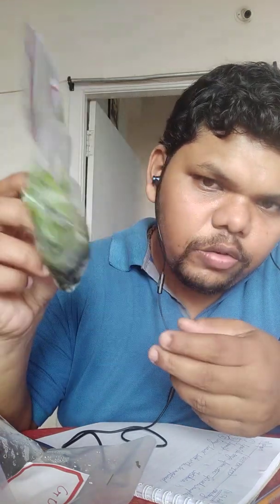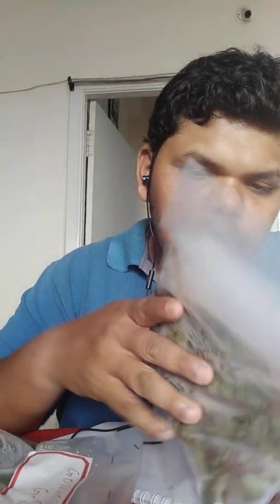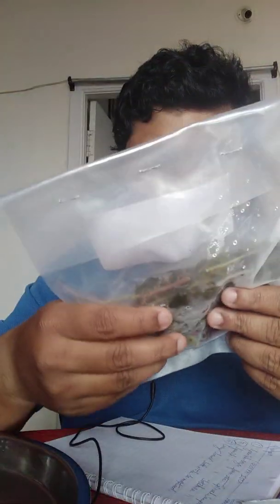This particular bag of spinach, you can clearly see it looks okay to me. The reason I had to store these samples was that I wanted to observe the formation of gas in it. It doesn't look that great, but still retains its freshness. Okay, so samples have to be dried at the earliest.